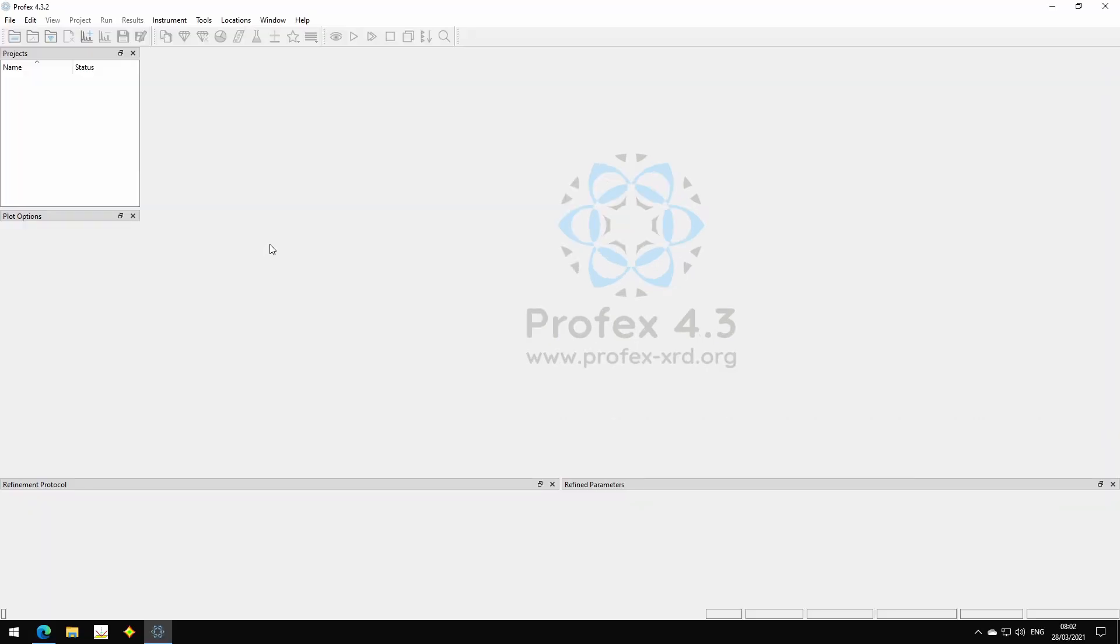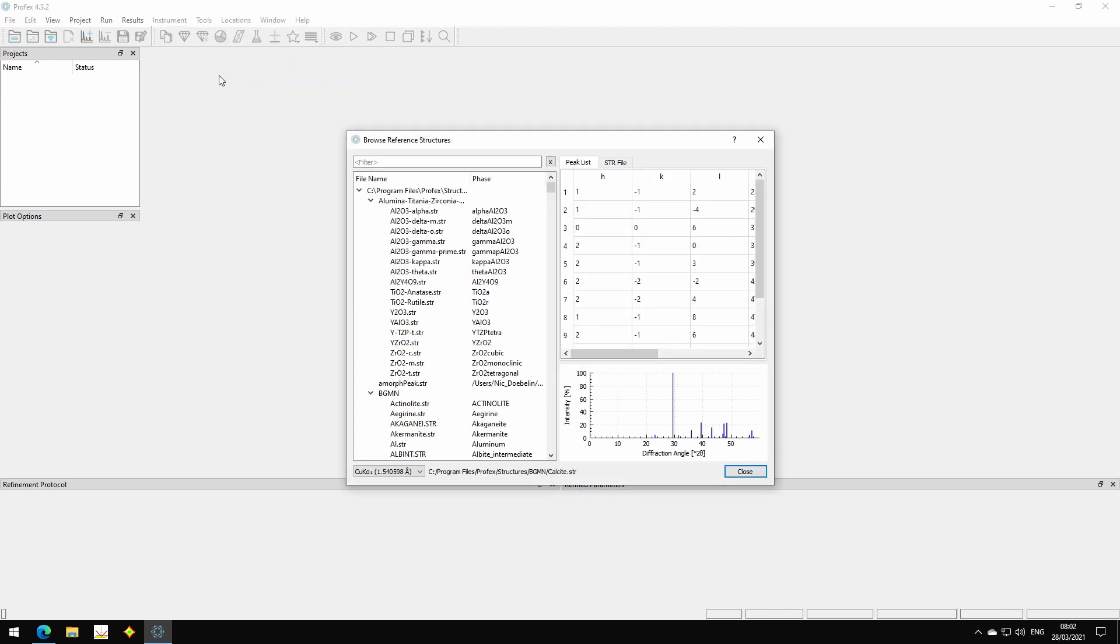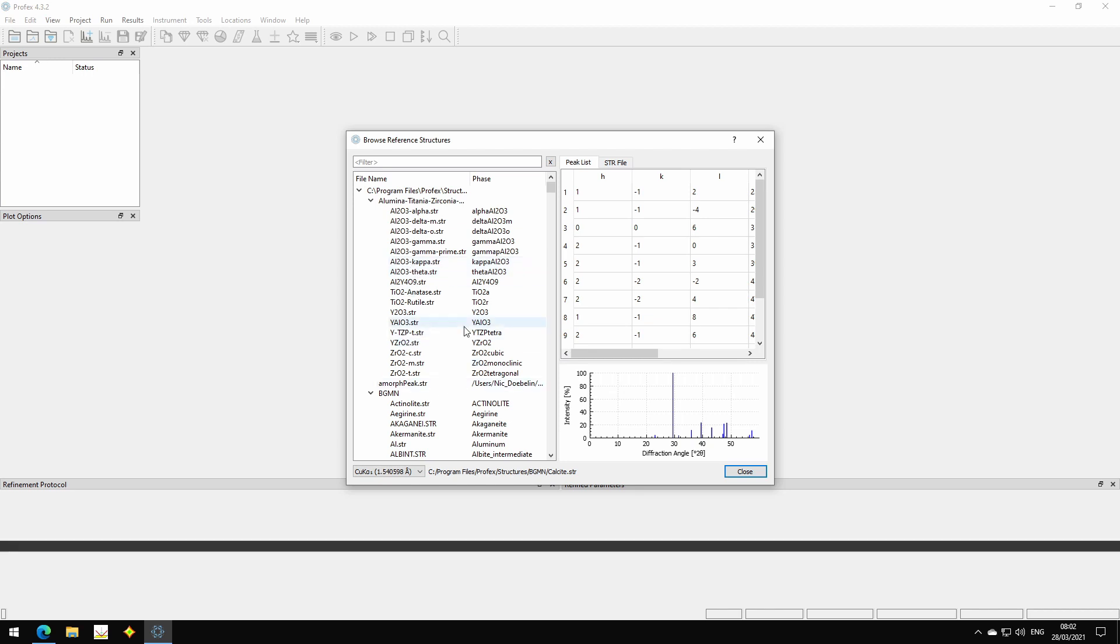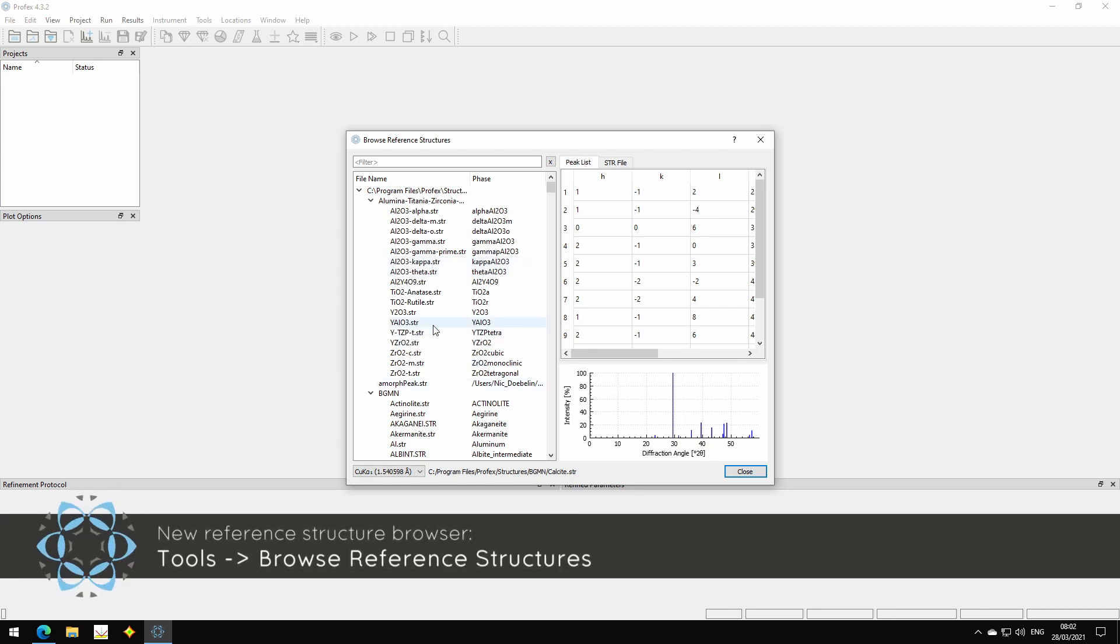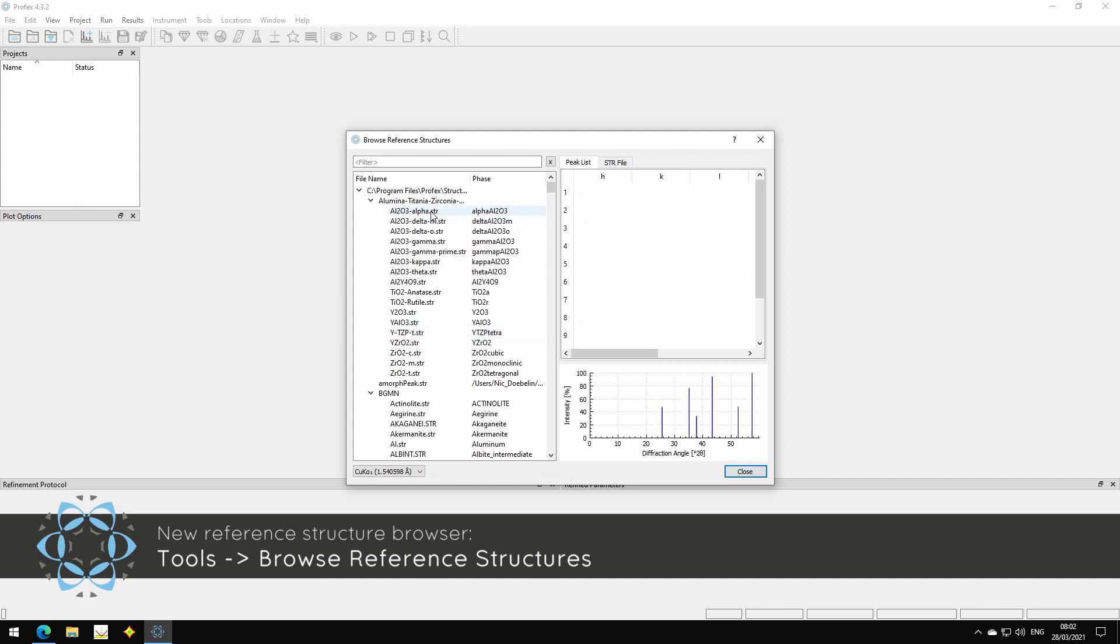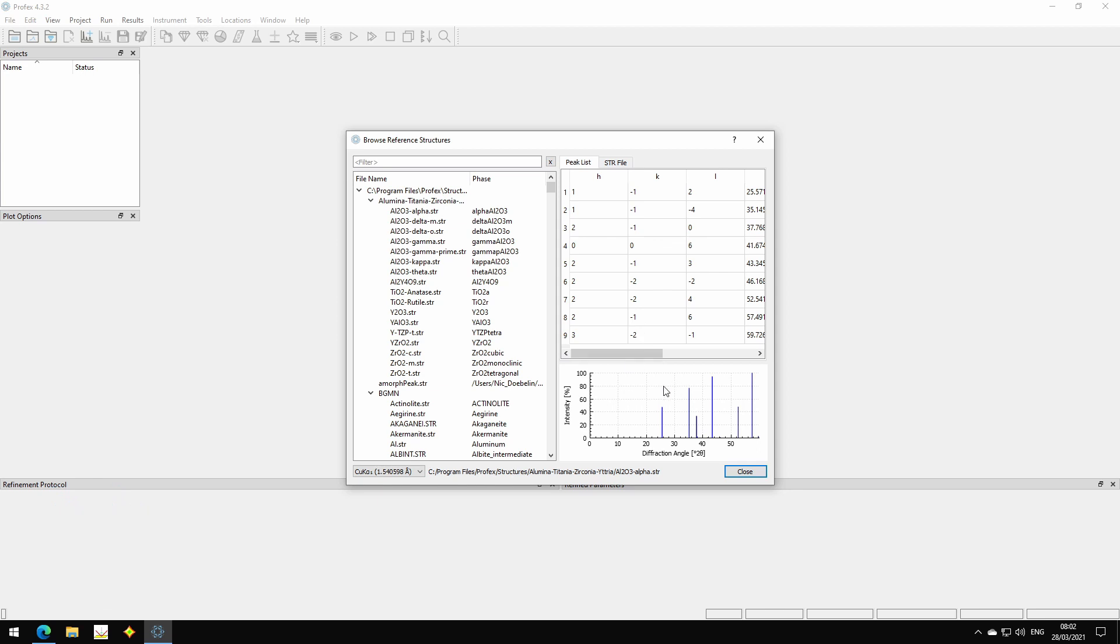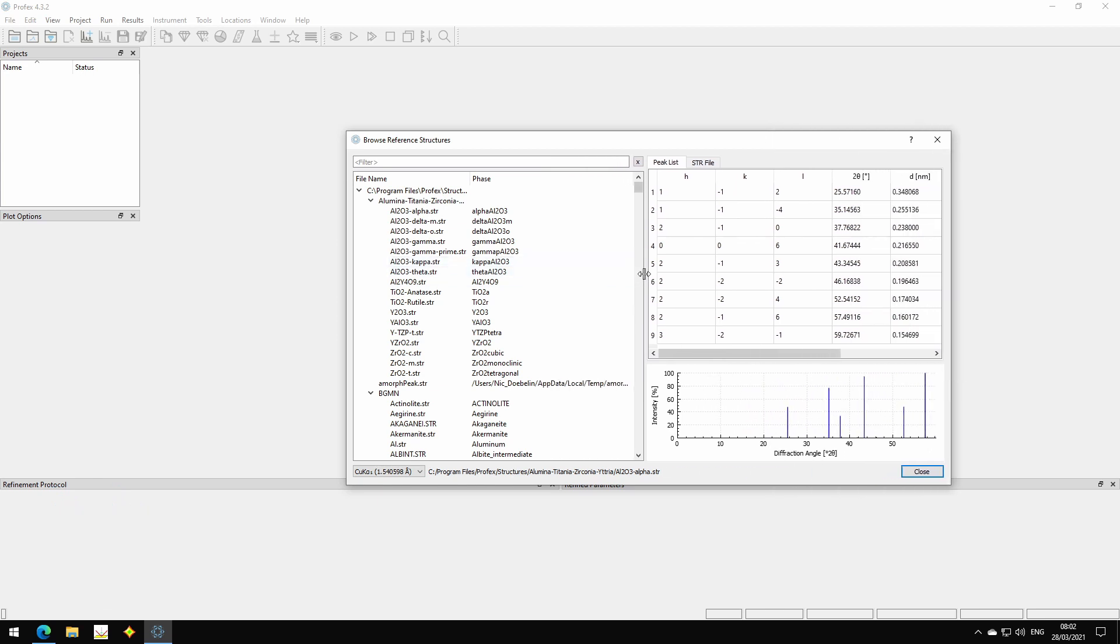The first new feature I want to show is in Tools. It's a browser for reference structures. If we open it, we will see all the reference structures stored in the Profex database. So all the structures we can also select from the Add Remove dialog, and we can just display the HKL lines as a list or as a graph at the bottom.